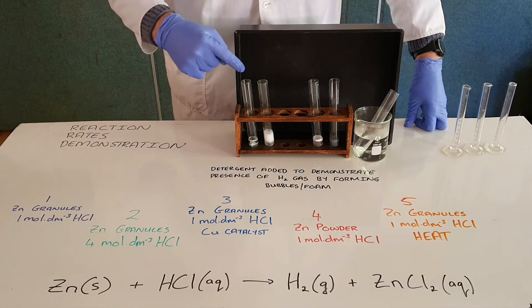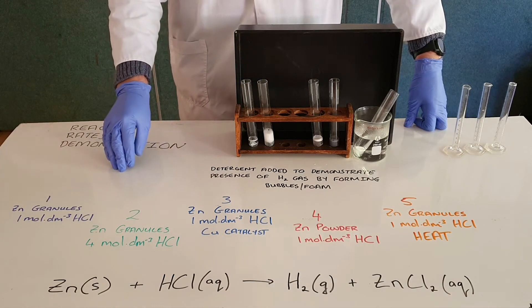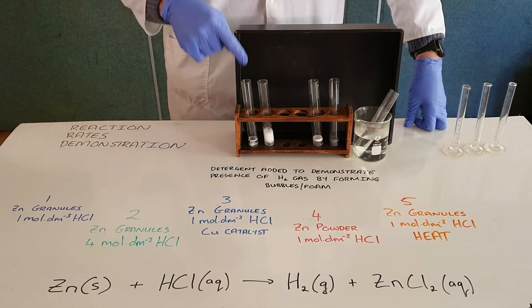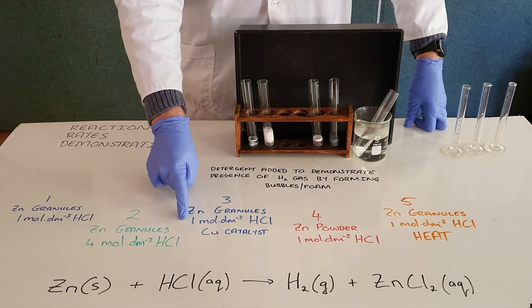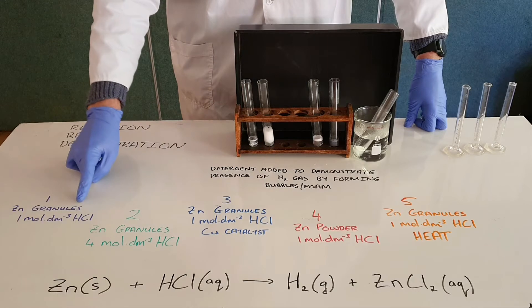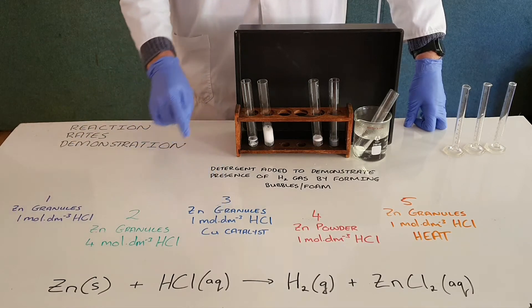And we can start to see that happening here with far more foam forming in the second test tube than in our first test tube. In our third test tube we have zinc granules and one molar hydrochloric acid, the one difference here being that we now have copper that acts as a catalyst.